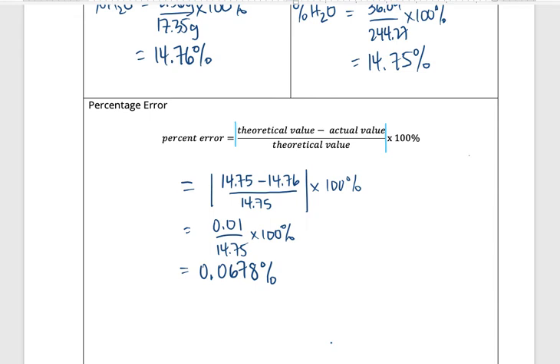Where did you maybe struggle to make sure that things were accurate and that you weren't losing sample, or where did you maybe possibly make an error so that you weren't evaporating enough water, or maybe you were adding water. Just think about all the different things. Remember, human error and instrument error. Okay, you can always blame those things. So think about, and again, it's you running the lab to the best of your abilities, and then there's still some things you can't control, right? I don't want you writing about things like, oh, I got pushed, or I dropped the sample and stuff like that, right? You want to talk about things that you can't control that are going to affect your results.